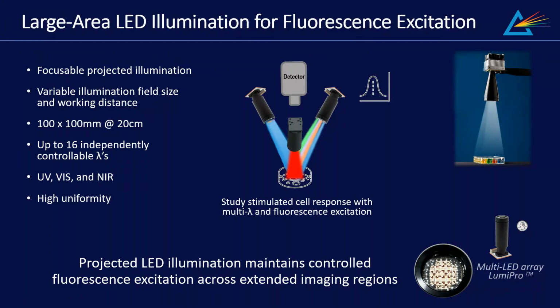Uniformity is another important consideration in large area excitation systems because spatial non-uniformity can directly influence imaging consistency and measurement repeatability across the illuminated field. Optical designs with homogenizers and appropriate imaging can provide uniformity better than 98%.